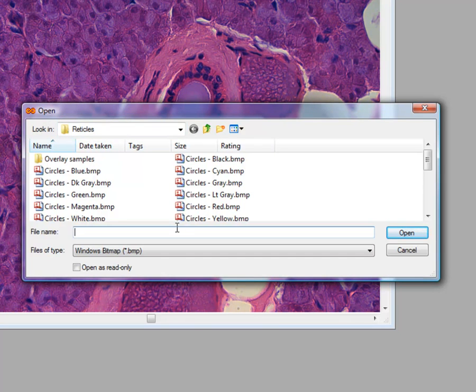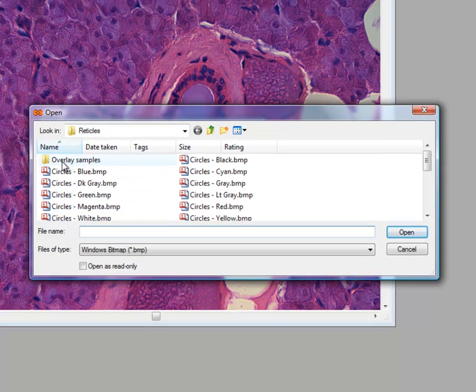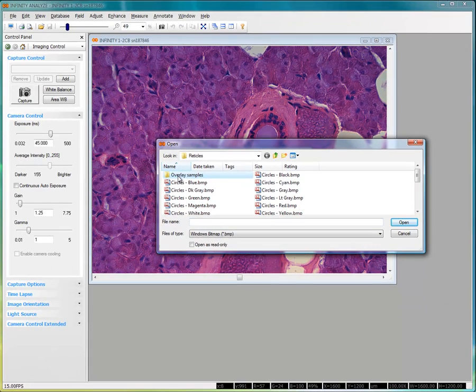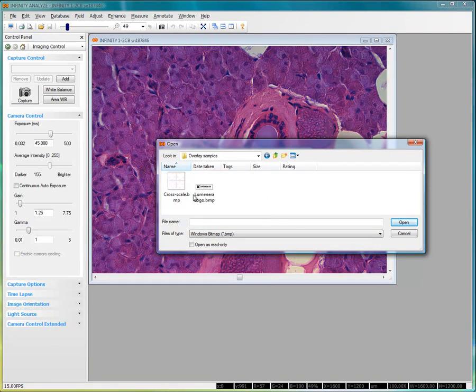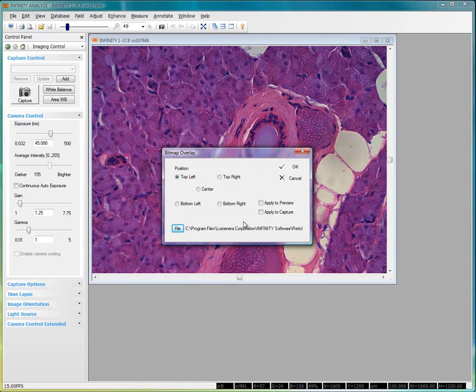Whether you choose to use an existing bitmap or prepare one of your own design, it's important to understand a few key points about how the bitmap overlay works. Before we proceed, I'm going to select one from a sample here and choose a prepared Luminera logo.